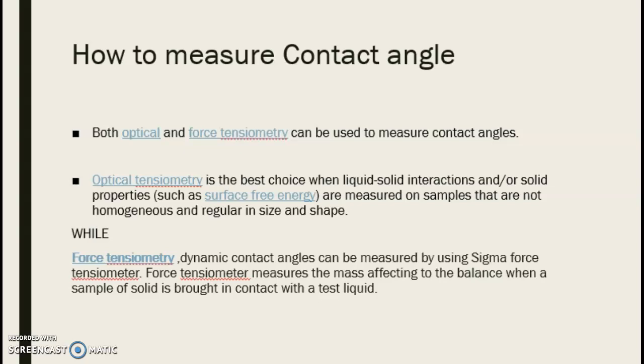in size and shape. The main benefits are small liquid volume demanded, only some microliters. The solid substrate can be asymmetrical, such as contact lenses, as an example, and both sides of the sample don't need to be similar, such as in coating and surface modification characterizations.